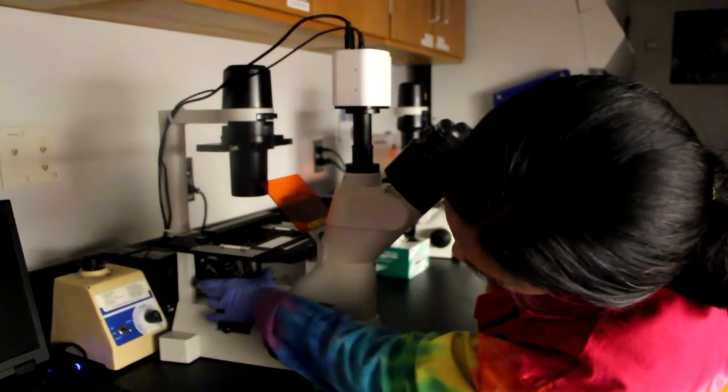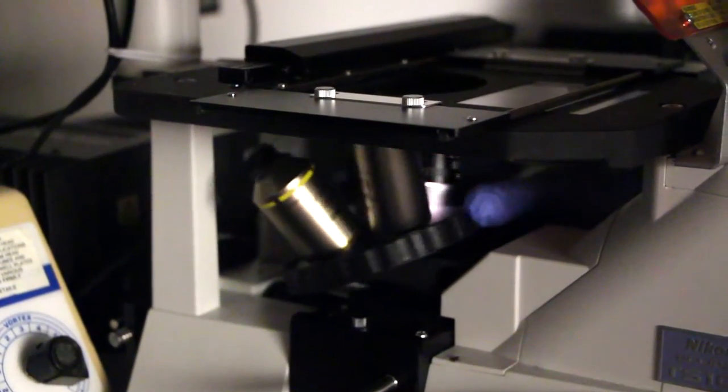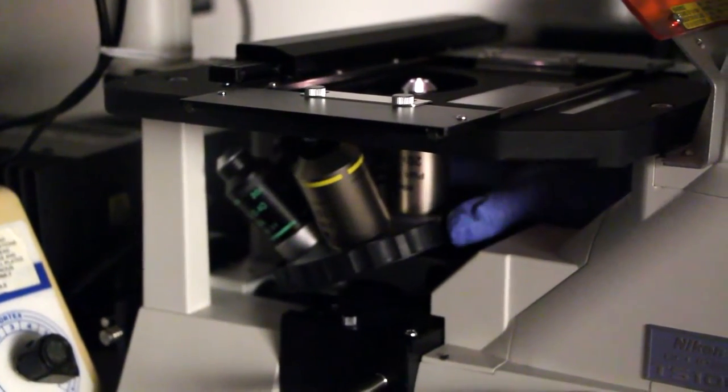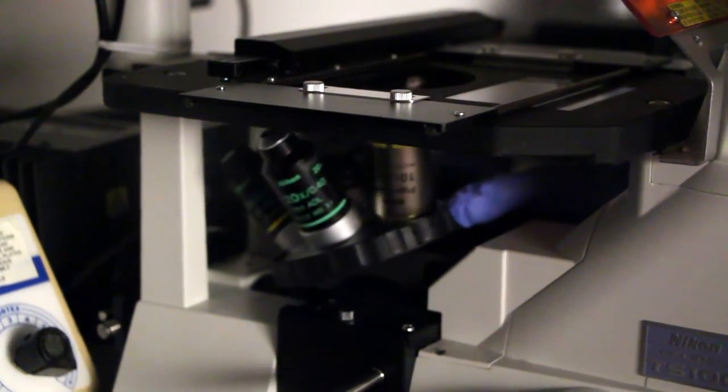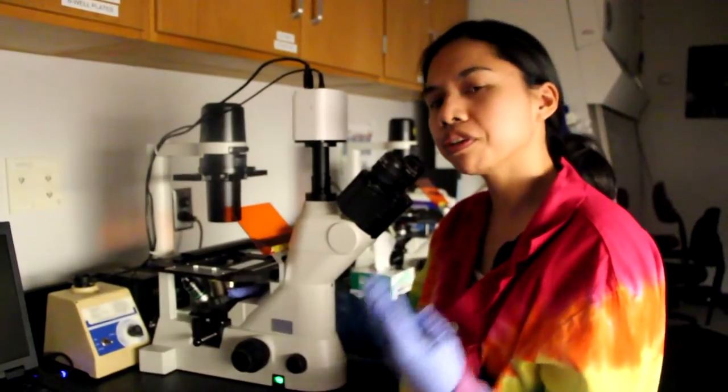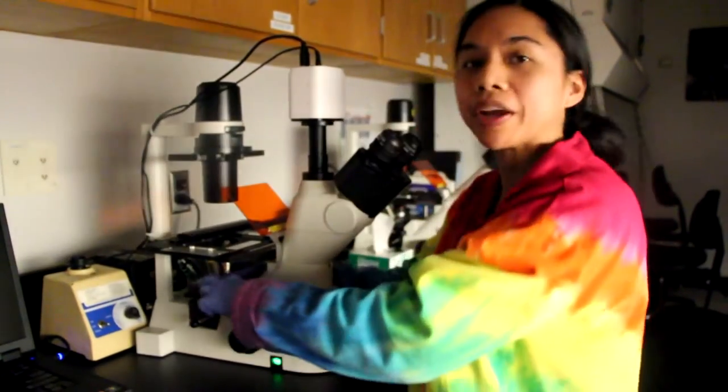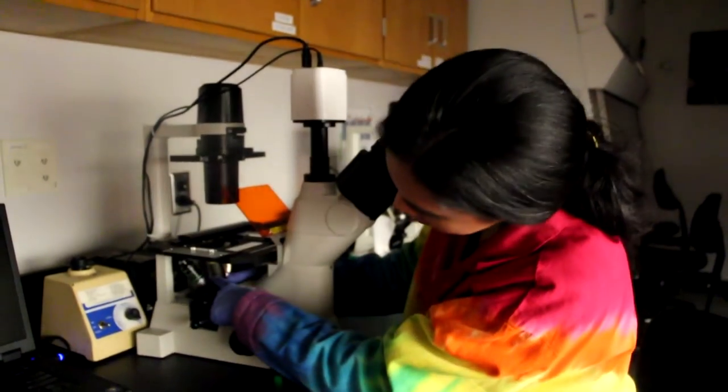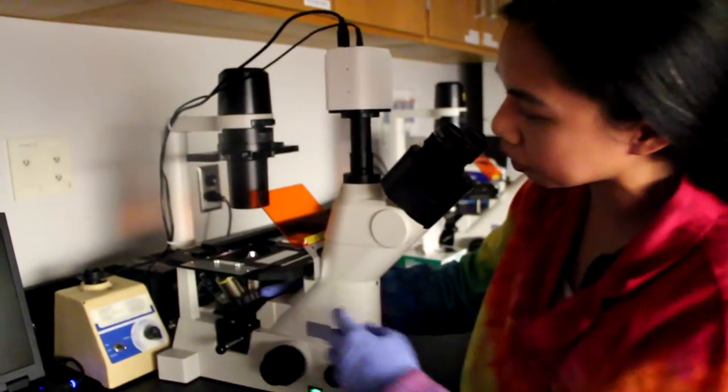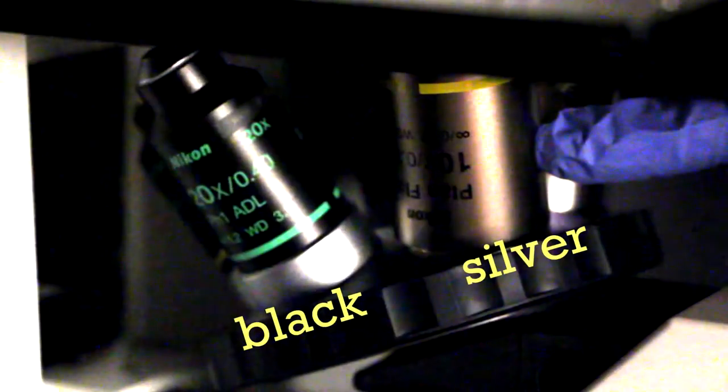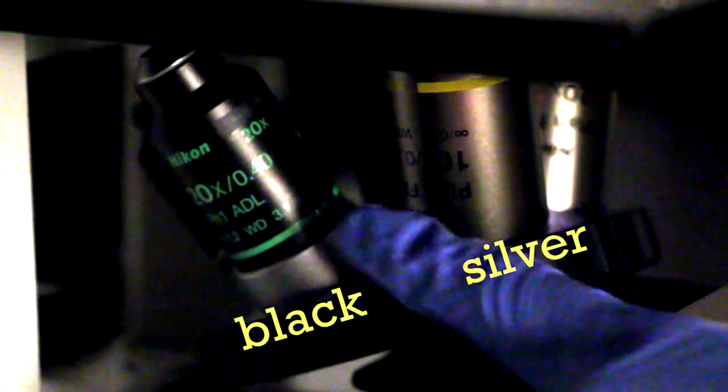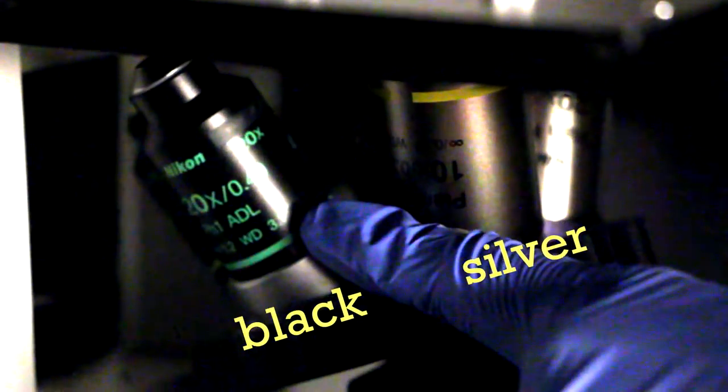And we can switch the objectives simply by rotating this little nose piece, it's called, down here. We have two different kinds of objectives on our nose piece, indicated by the color. So the silver objectives are optimized for fluorescence microscopy, while the black objectives are optimized for bright field and phase contrast microscopy.